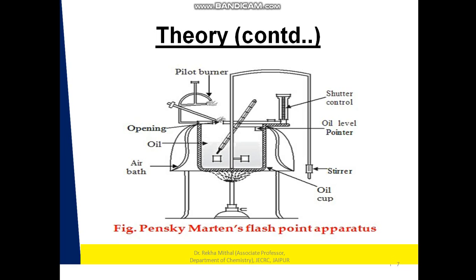Its different parts are the pilot burner, opening, oil taken in the calorimeter, air bath, oil cup, stirrer, oil level pointer, and shutter control.